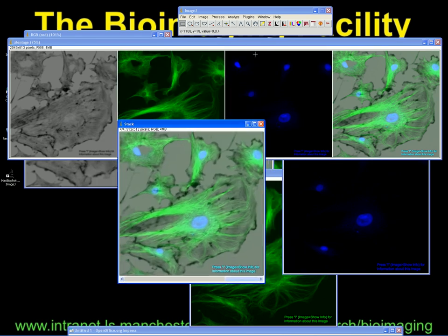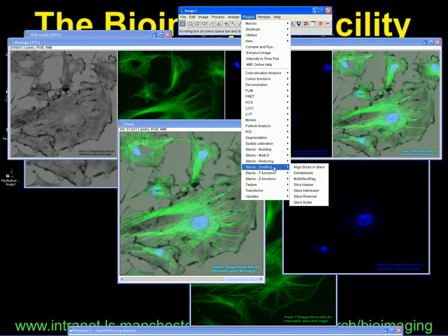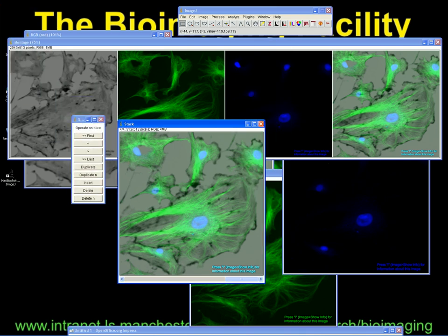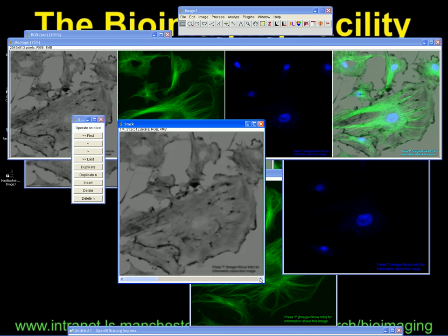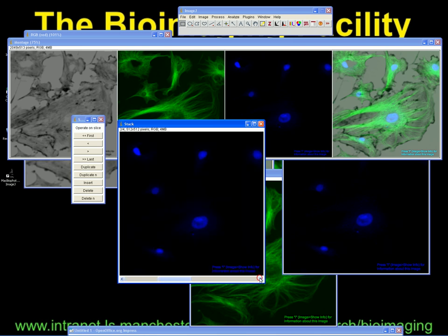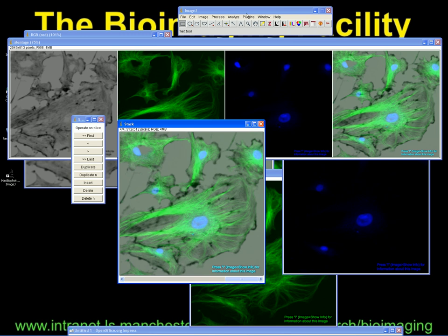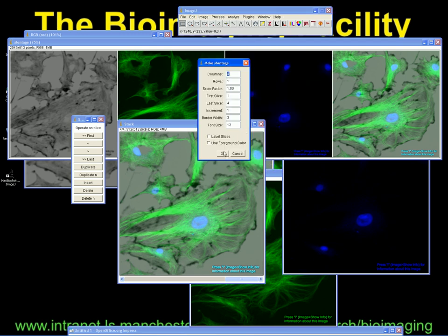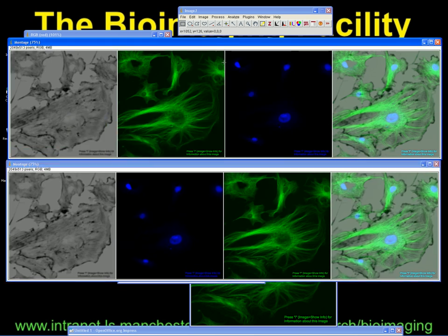If we wanted to change that order, we can launch a plugin — Stacks Shuffling — and there's a Stack Sorter button. That allows you to change the order of the stack. So if you wanted green and blue switched, go to your green image and use the nudge forward or backwards buttons, or send it to the beginning or end. Now we've changed the order to grey, blue, green, merged. Under Image, Stacks, Make Montage — same as before — and this time we've got the stack in a different order. That's using it from the three-colour image.